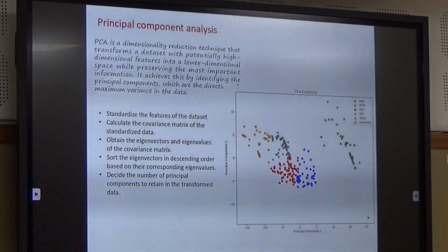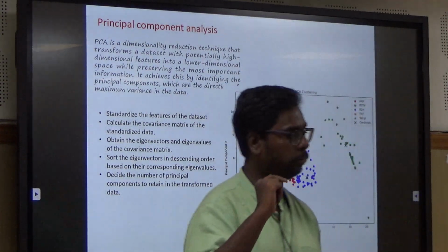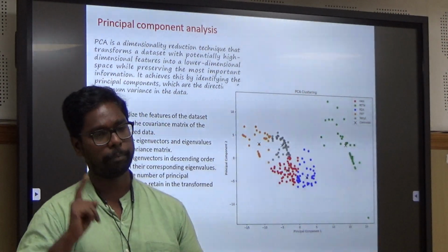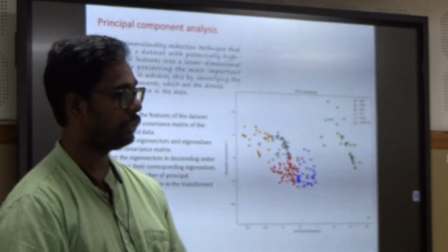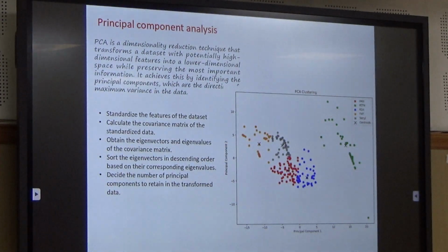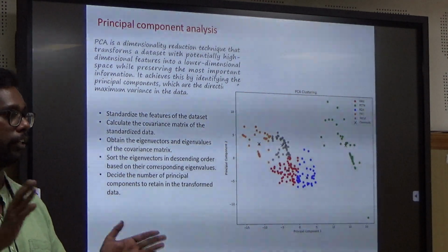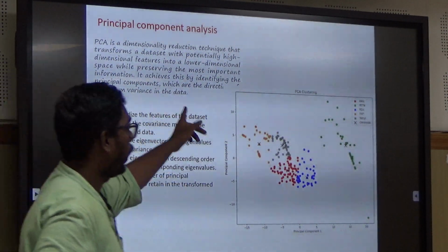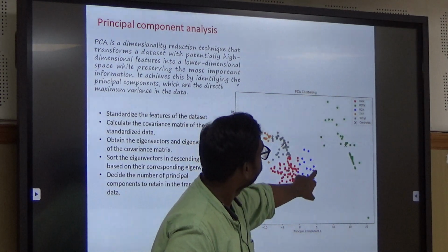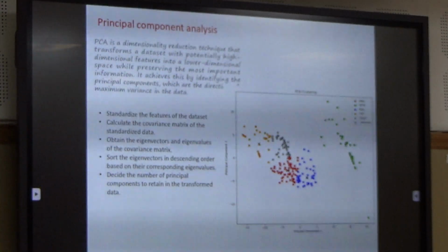principal component analysis. You have a huge amount of data. You want to see how the principal component analysis identifies the data. The advantage of principal component analysis is that it reduces the dimensionality, meaning unnecessary data is avoided. The 90 spectral features are reduced to 50, so the remaining 40 unnecessary data points are avoided. And I can see all the data clustering according to their pattern. RDX, HMX, PETN are clustering. So this algorithm is identifying the patterns, or what features are present in the data.